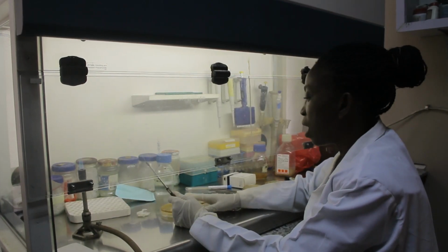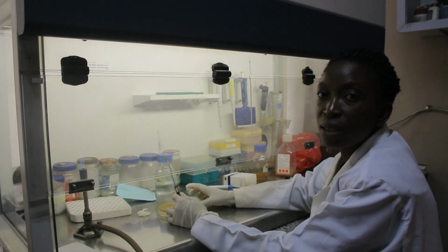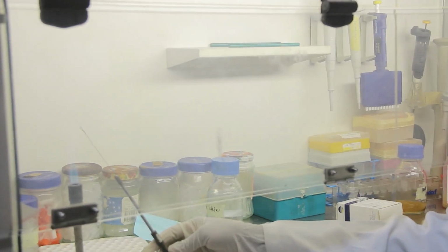After confirmation of the presence of H. pylori on the plate using catalase, oxidase, and urease, the distinct colonies will be subcultured into a fresh serum plate.